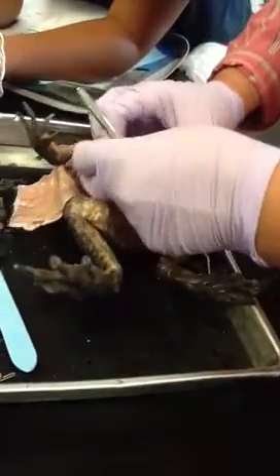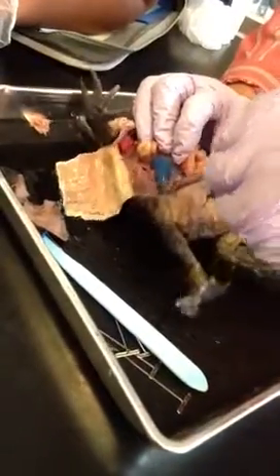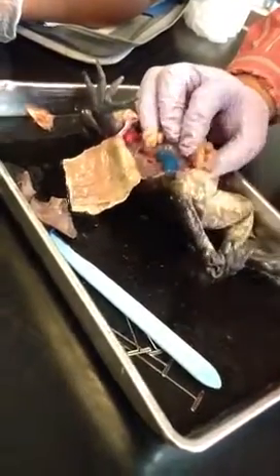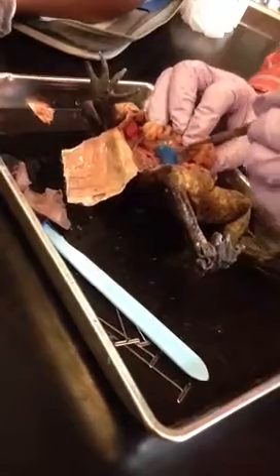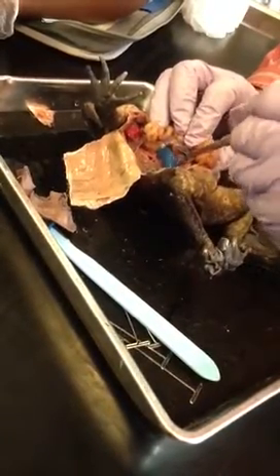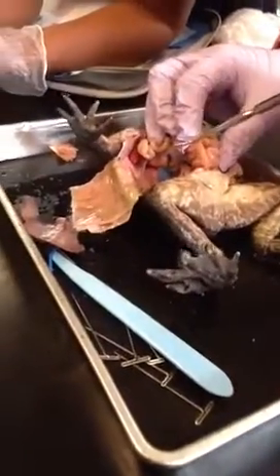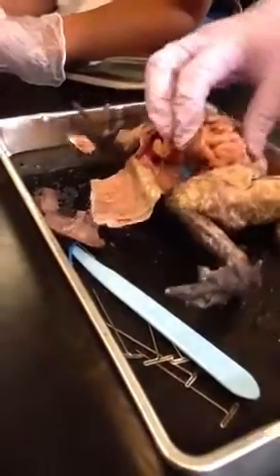We couldn't find the urinary bladder. What we're going to do is we've got to pull this tissue away. This is peritoneal tissue. Humans have it as well. It kind of keeps the kidneys in place. Now kidneys normally have a reddish color. Because these have taken up so much dye, they're blue. That is her right kidney there. Can you see that? Okay, and you have one on the other side as well.